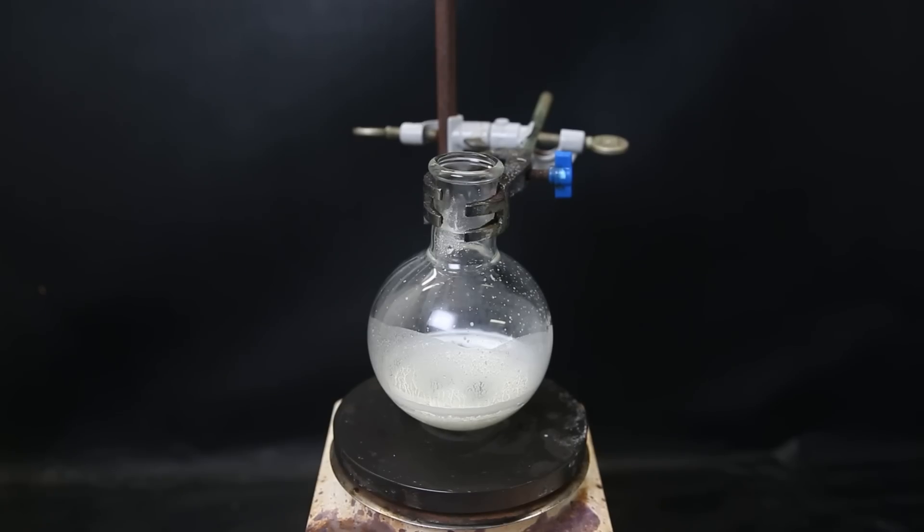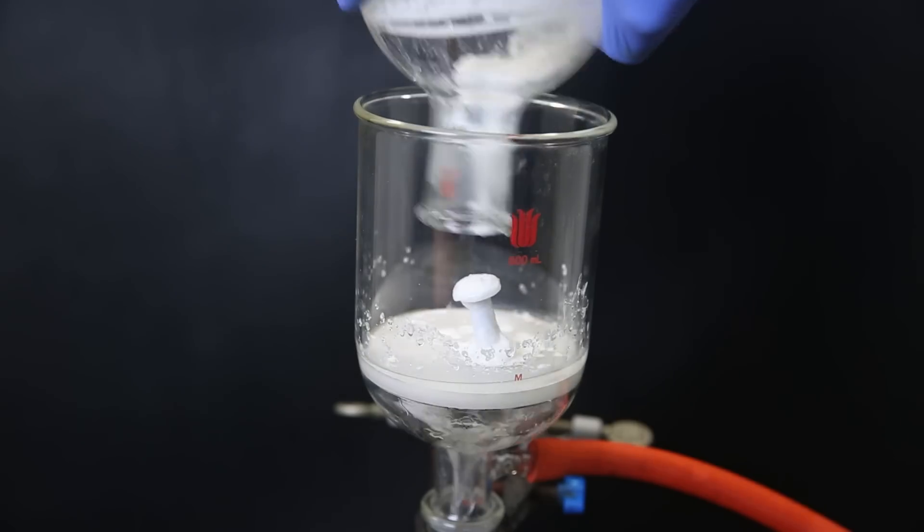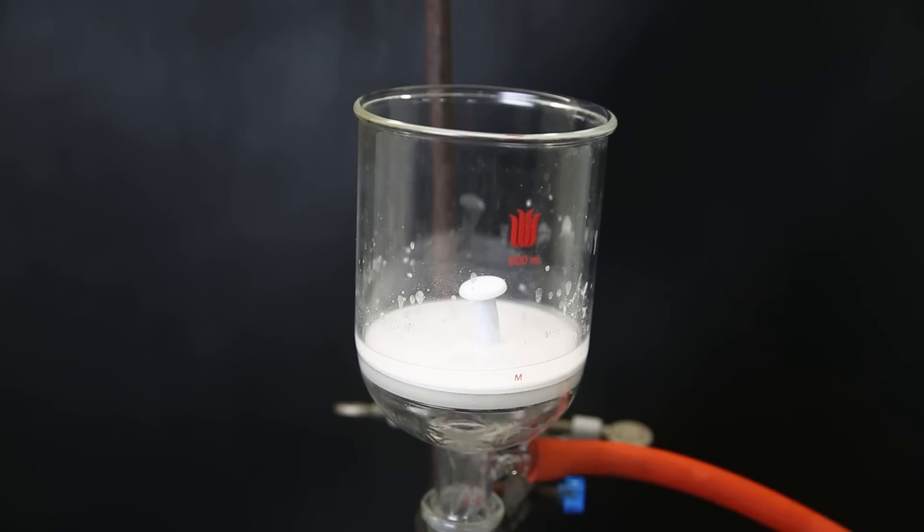When I come back the next day, a bunch of white solid has precipitated, which should be the bisulfite adduct. I set up a glass frit with a filter paper again and filter it all through. I wash it out and down with ether to remove the impurities that are still soluble in the ether, while the benzaldehyde stays behind on the filter as the bisulfite adduct.